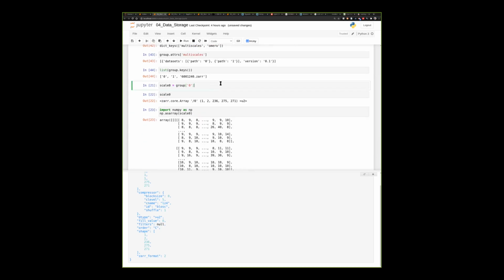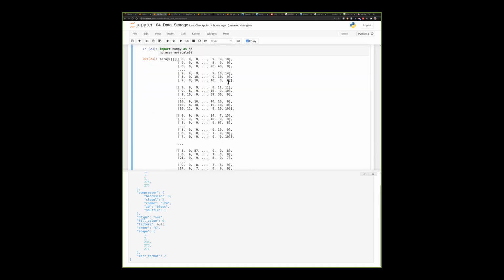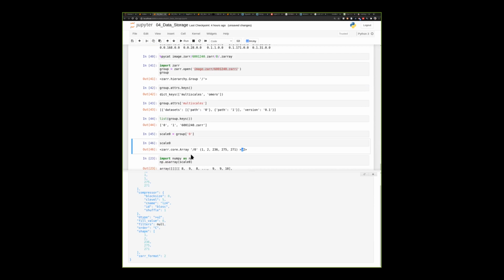And then we can get metadata about the image pixels, the bulk data itself. And that loads very quickly. But we see that the type of that data is this Zarr array, which is this lazy array. And we know the shape of the data and the type of the data, but we don't have to read the actual pixel data itself to learn about that data set.